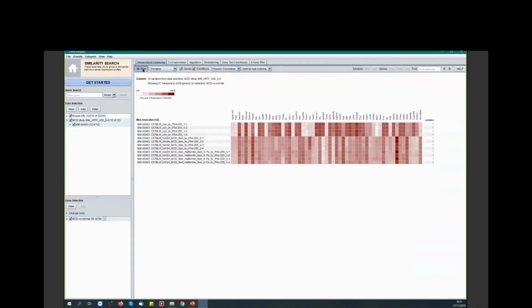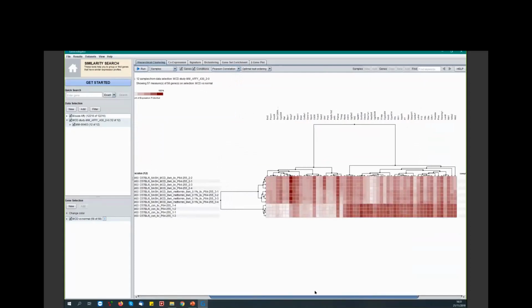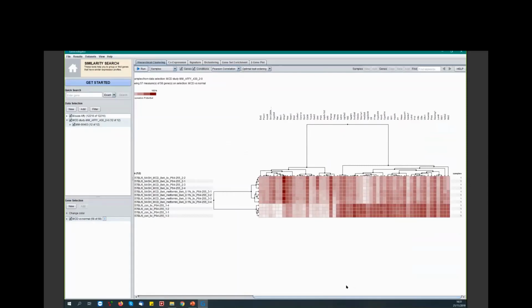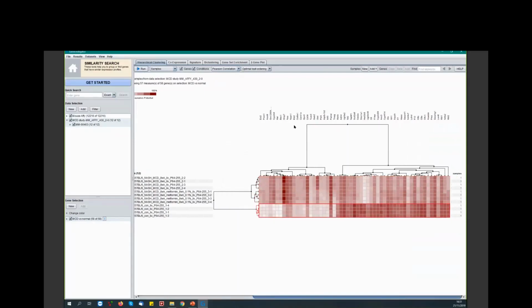If I now click Run, you will see a demonstration that is similar to what Anne has shown you when she performed the Heatmap analysis in Qlucore's Omics Explorer. What we can see here is that the 4 biological replicates for every condition cluster closely together. And these you can see here using the nodes. And that the expression of our 58 genes seems to be most different between this control group as compared to the 2 diet-fed mice.